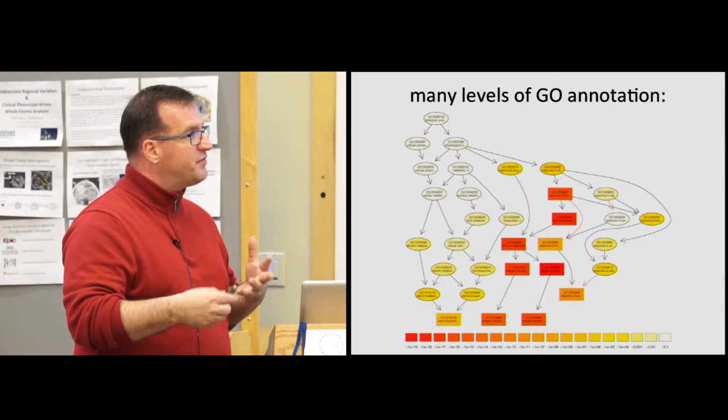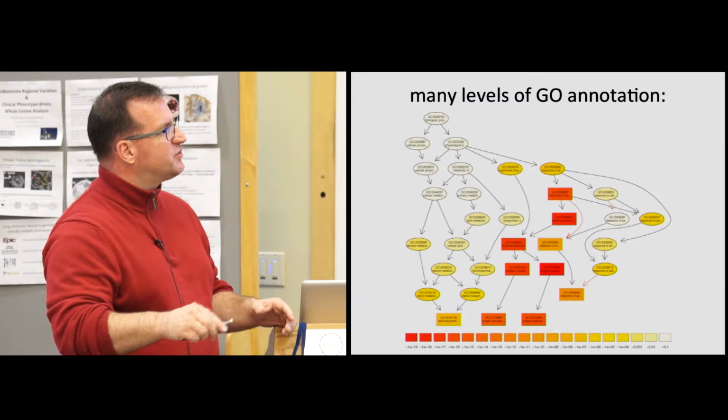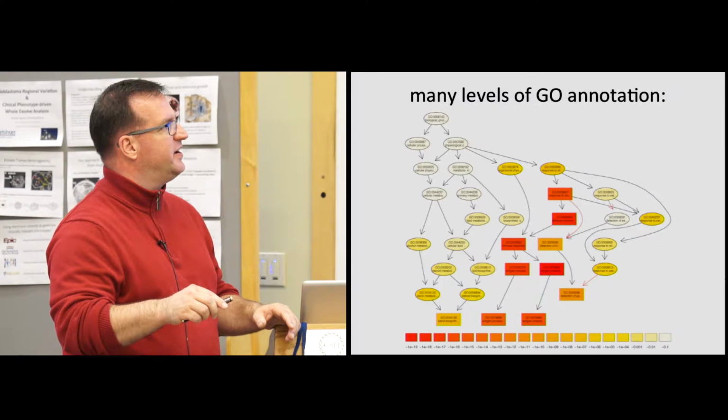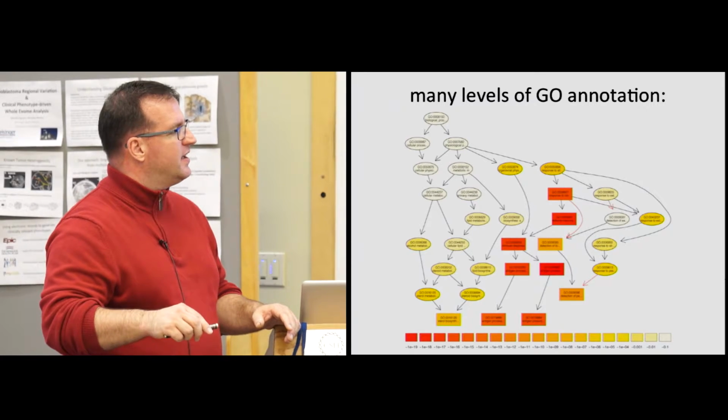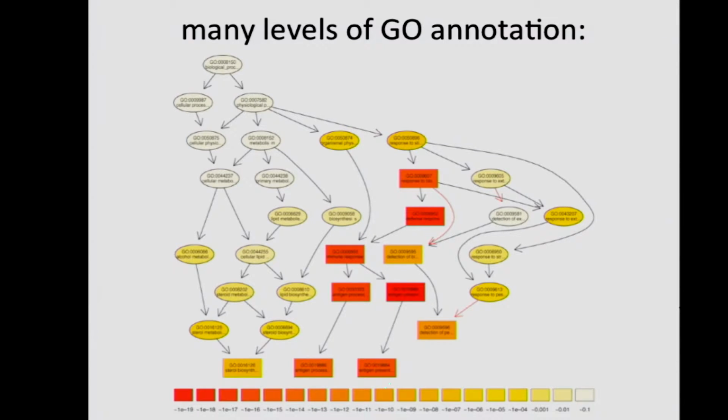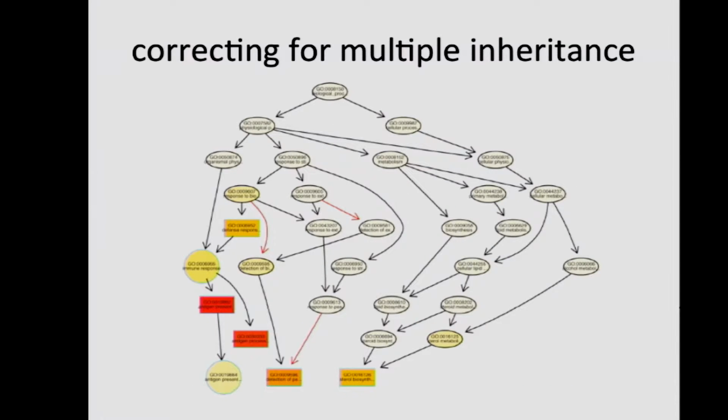There are ways to correct for that. You would like to say, well, where's the real action here? Is the action here and this is just dribble down, or is the action here and if I pay attention to this set of genes and then subtract that set of genes from everything else, is there actually more residual activity somewhere else? And that's what this is.